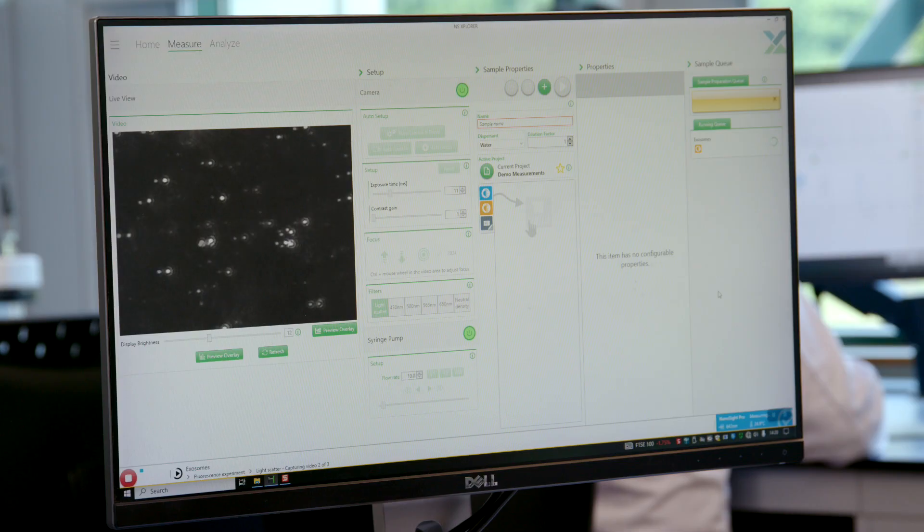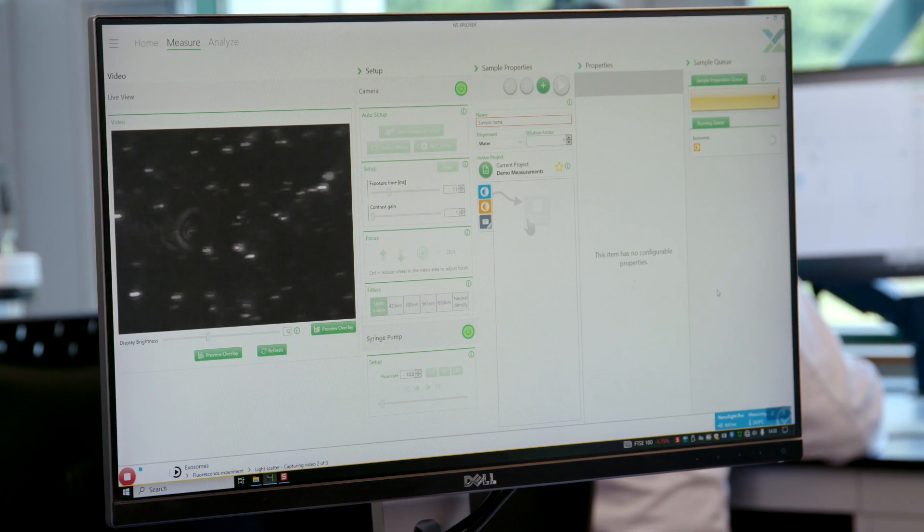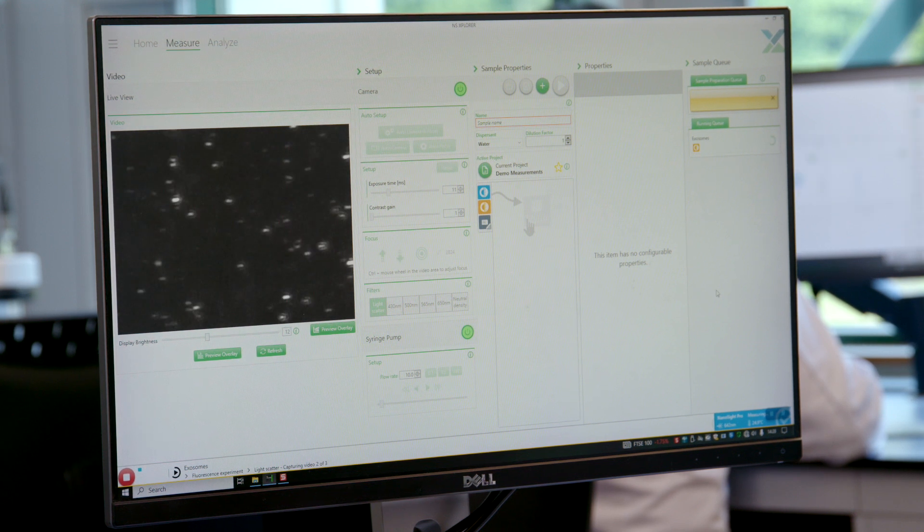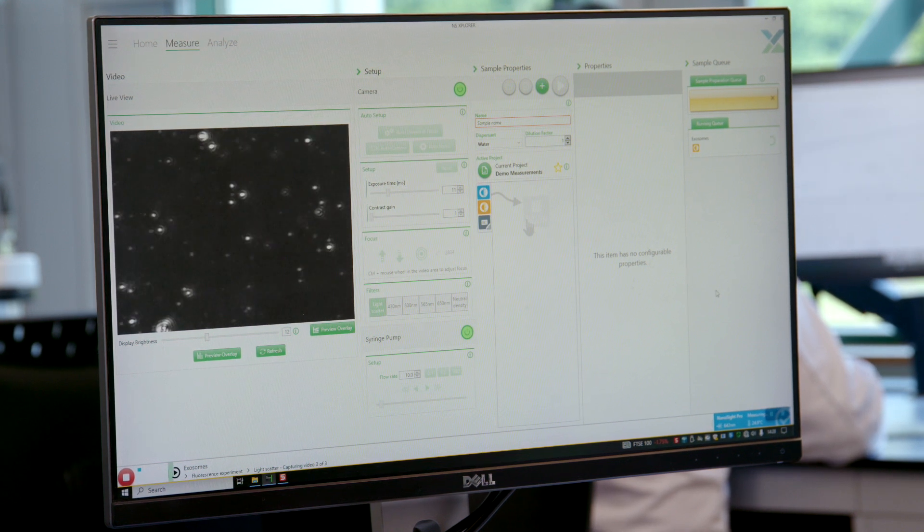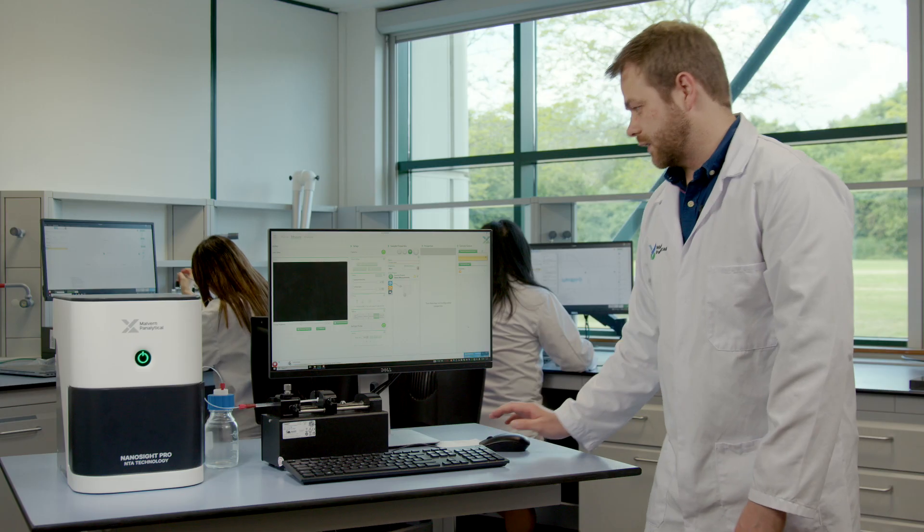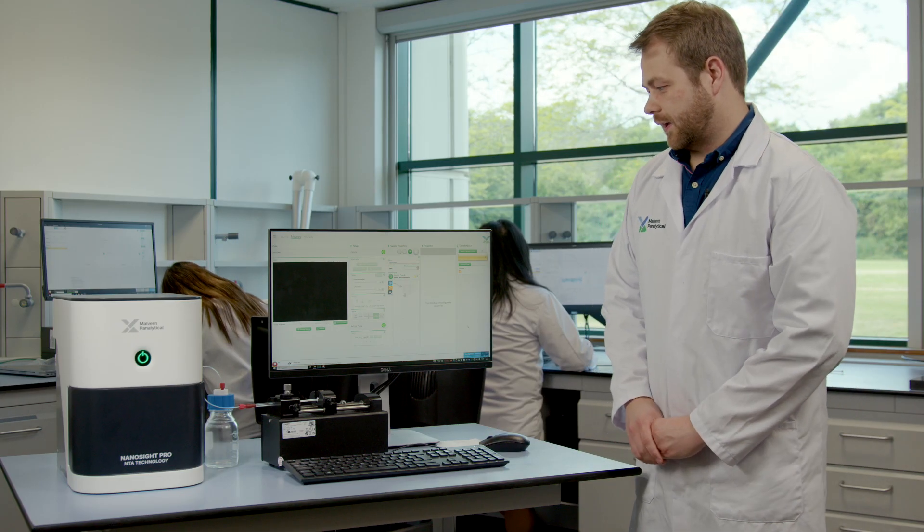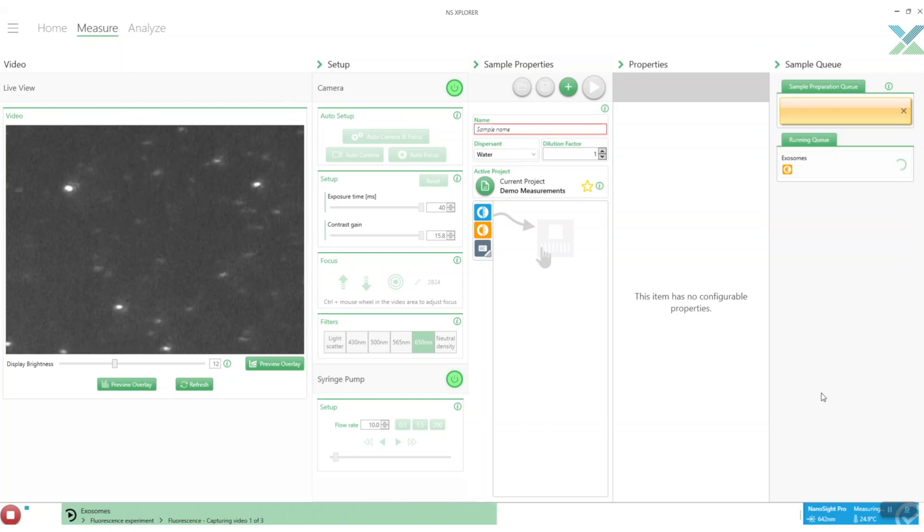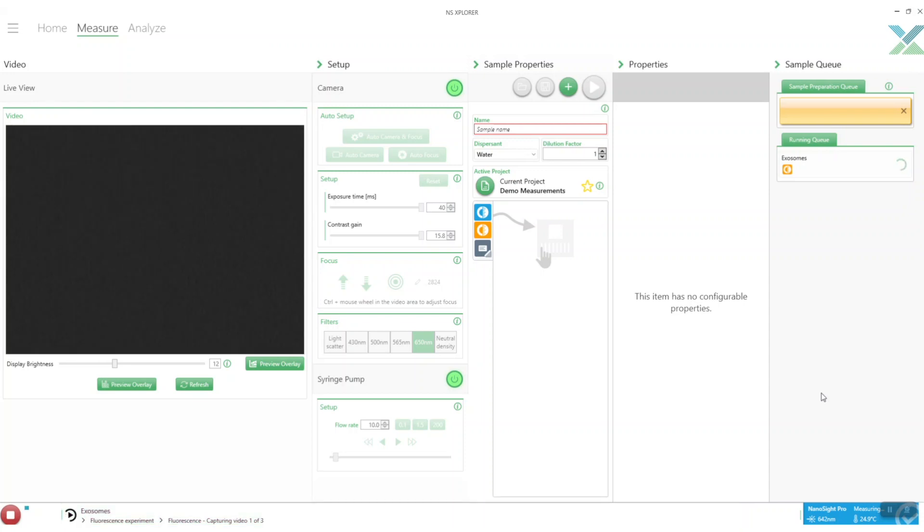Once this sample has finished all three captures it will then move on to the fluorescence part and then it will start off with the camera off because again we want to avoid photobleaching. The camera won't be on so we avoid disturbing our sample and when it captures, in between each capture it will turn off the camera again to avoid that photobleaching and making sure we're going to get a good fluorescence measurement so we can compare well to our scatter part.